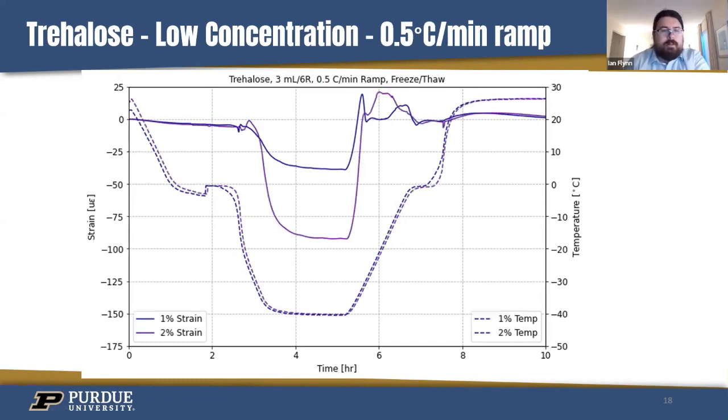where we're seeing it for water. Then increasing to 2%, we start to see this strain increasing very rapidly compared to what we saw for sucrose, a peak around our glass transition, and a peak around negative 22 degrees Celsius with the same uneven profile. At 3%, we're seeing a very similar trend, although our glass transition is becoming a little bit more of a shoulder and it's less of a well-defined peak.